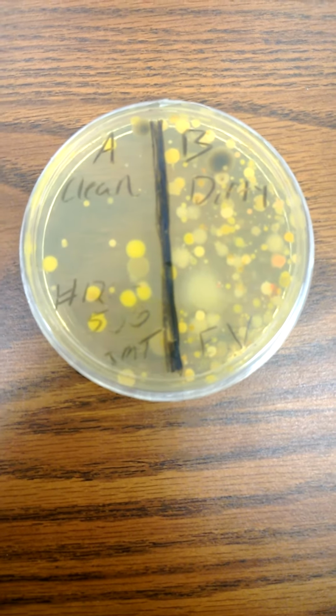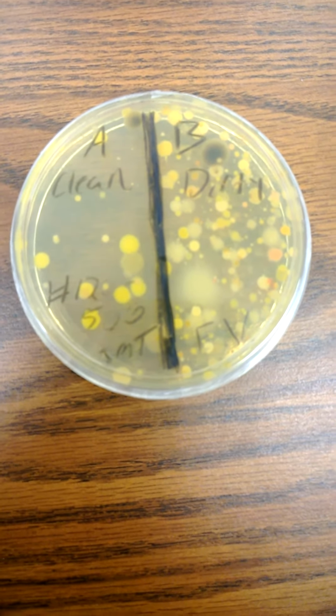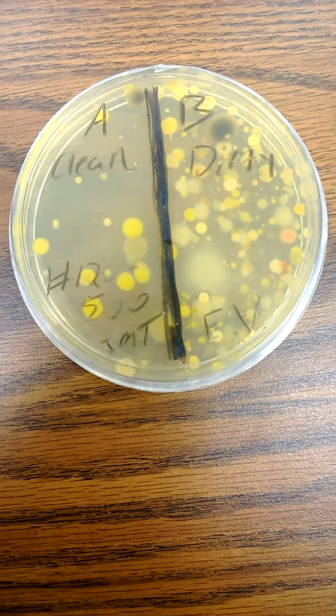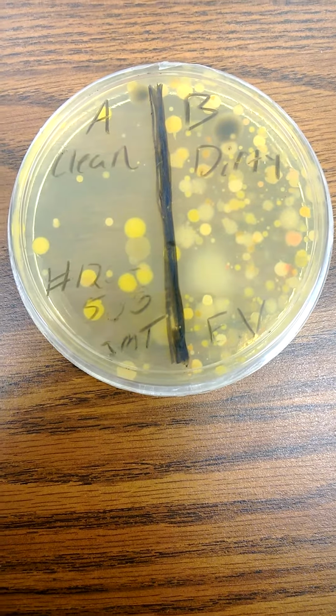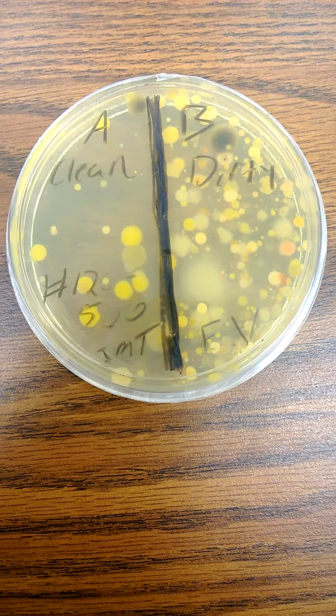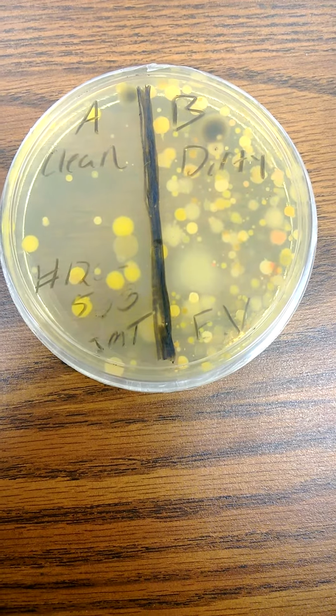You also chose a surface B, which you considered your dirty surface, or having more bacteria. For example, some of you might have swabbed the poster in the lab room as being your clean surface. You also might have swabbed the lab door handle as being your dirty surface, or the surface you thought would have more bacteria.